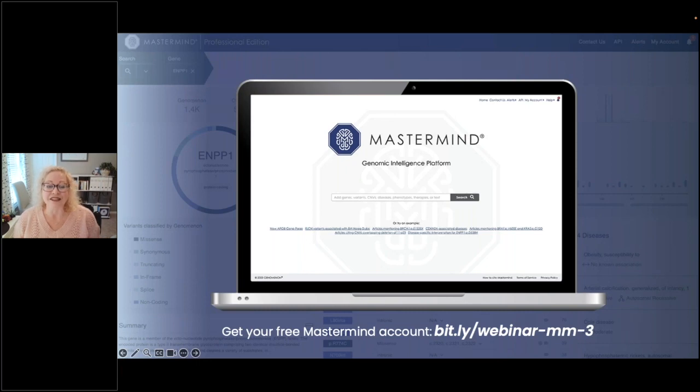In today's masterclass, our Mastermind experts will guide you through the new page, which greatly expands Mastermind's utility by providing comprehensive gene information, including gene-disease relationships, ACMG gene-wide parameters for variant interpretation, and other useful tools.